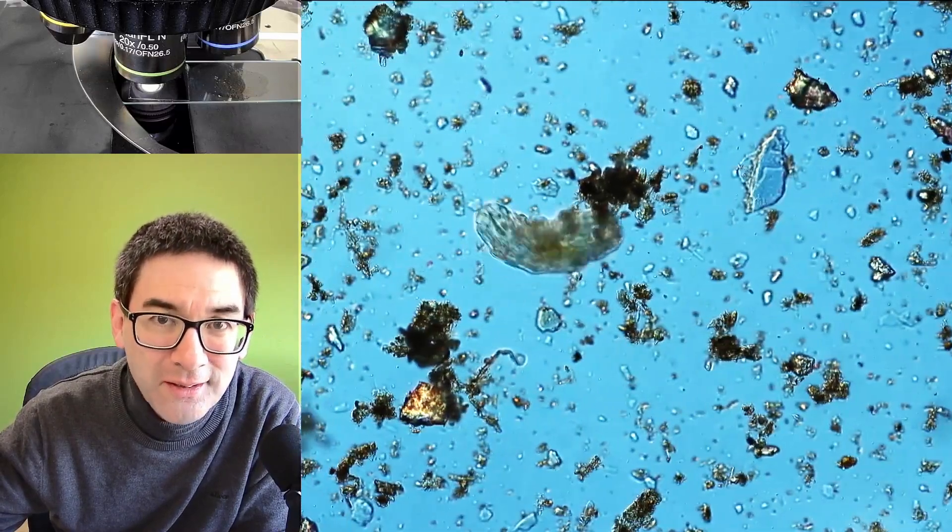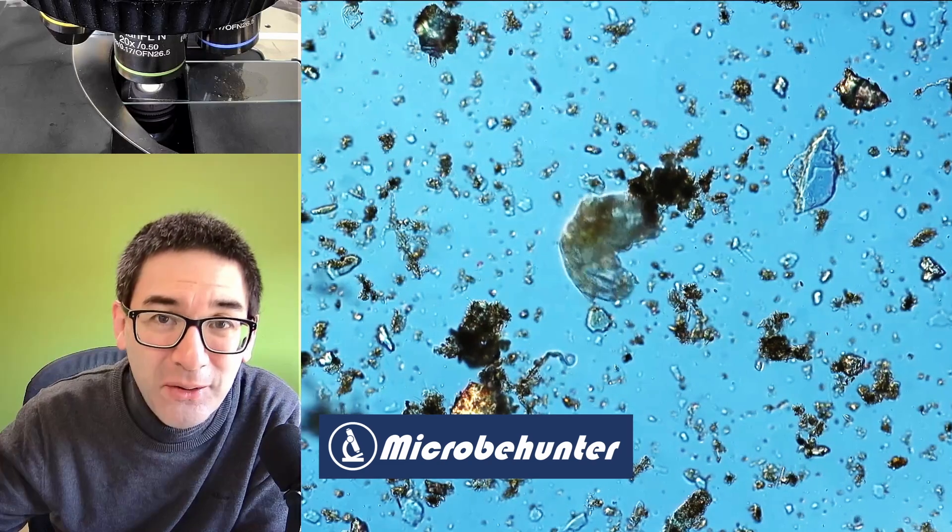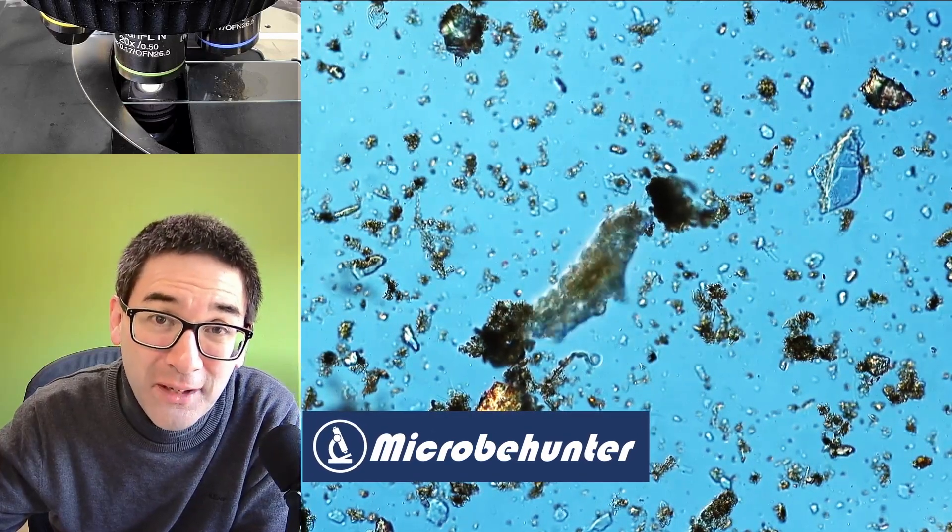So this here is a tardigrade under the microscope. They're also known as water bears and today in this video I'm going to show you how I caught it and where I found it.